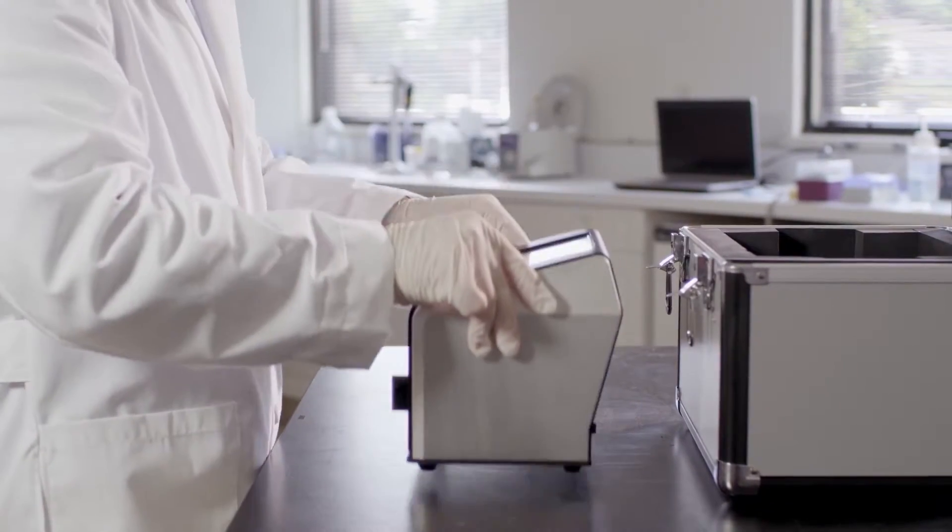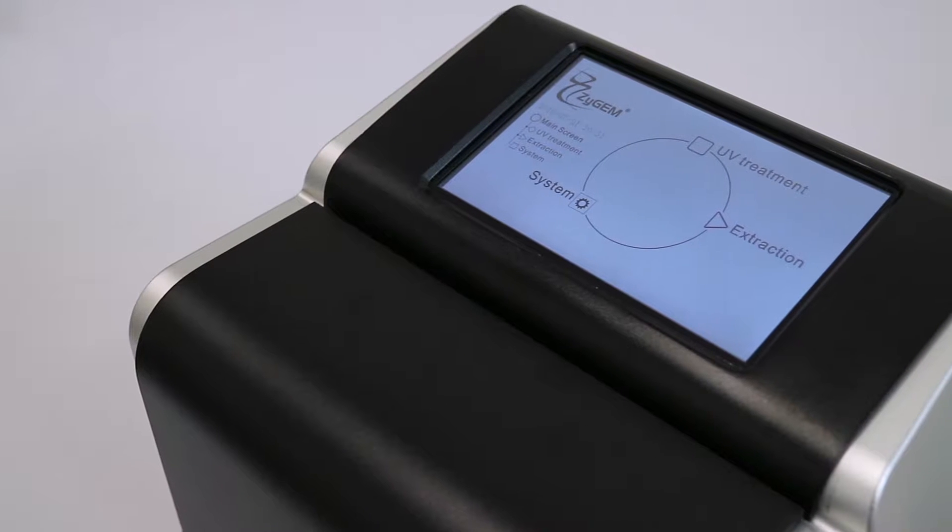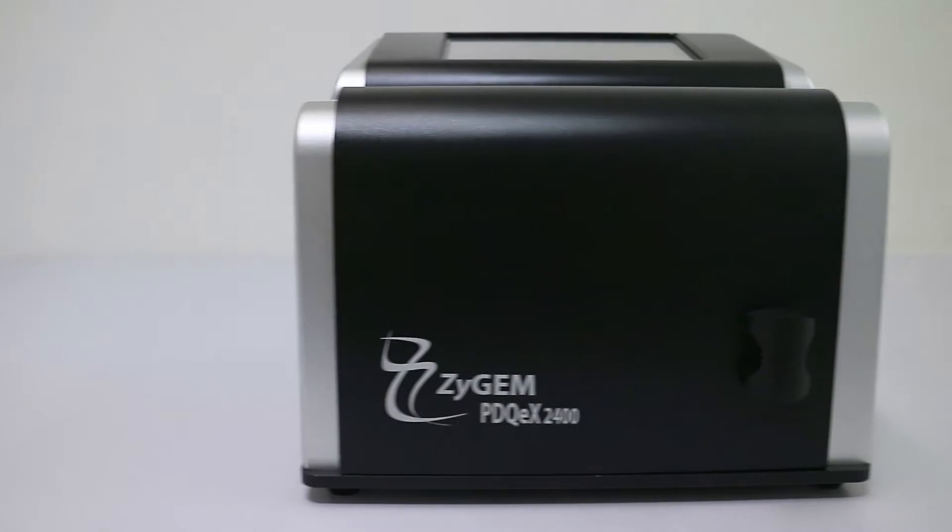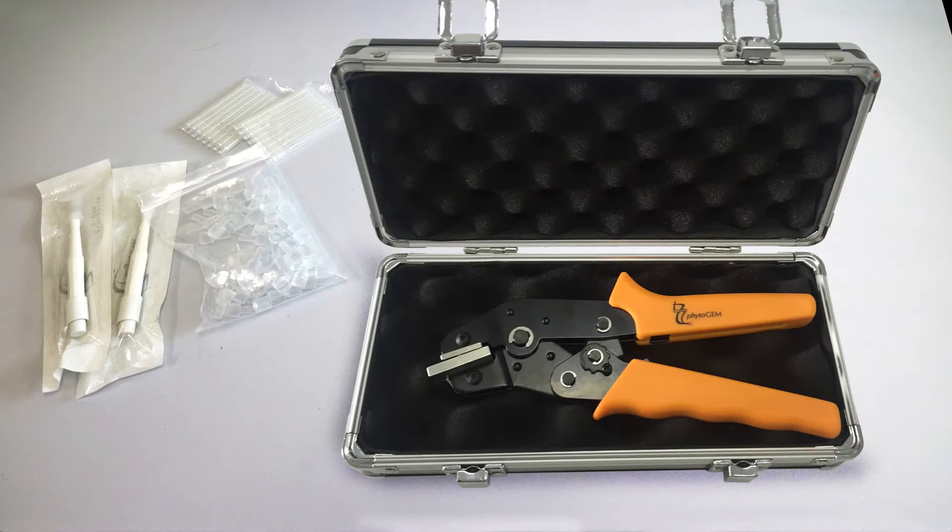The Zygem PDQX2400 is a rapid DNA sample preparation platform. When used with Phytogem extraction reagents and collection tool, it provides an integrated system for sample collection.